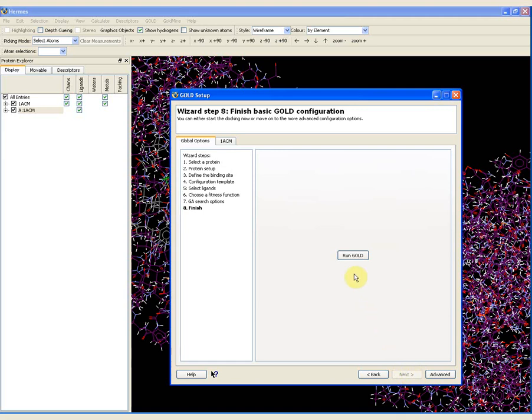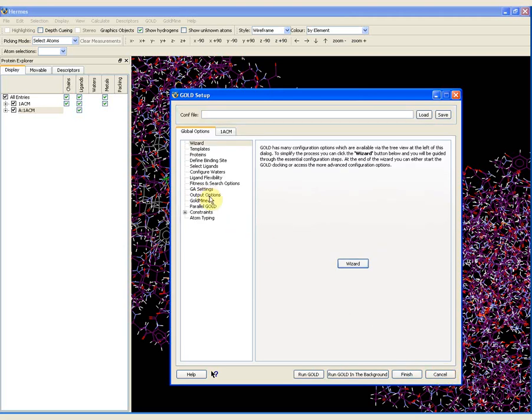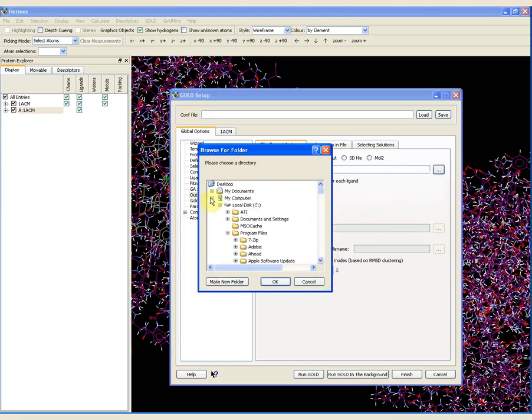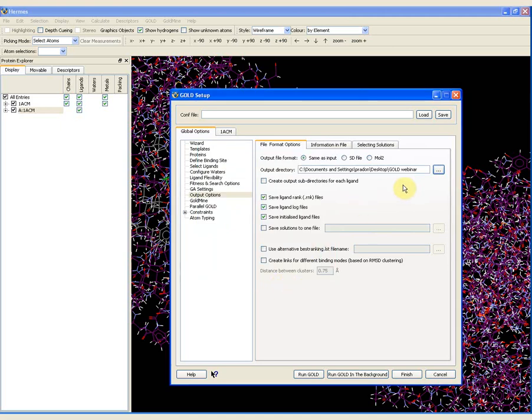If I click next again, I am now presented with the option to run GOLD. However, I am not going to run GOLD immediately — I need to do just one more thing. I click on the advanced button at the bottom and go to output options in the list on the left. I need to specify the output directory for my results. Currently it is set to one of the installation folders for GOLD, which is likely a place where I do not have read and write permission. So I am going to put the output directory as the gold webinar folder on my desktop, navigating using this button. I click OK, and now all my output is going to go into that folder.